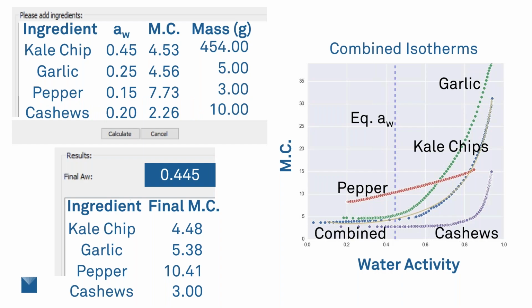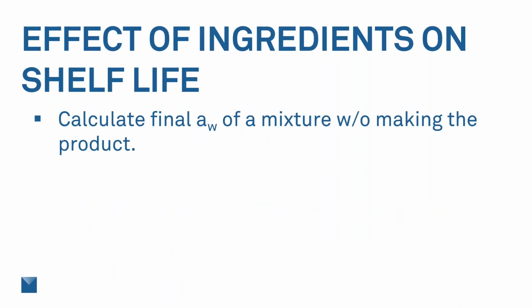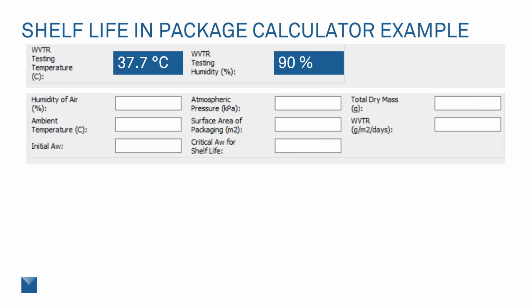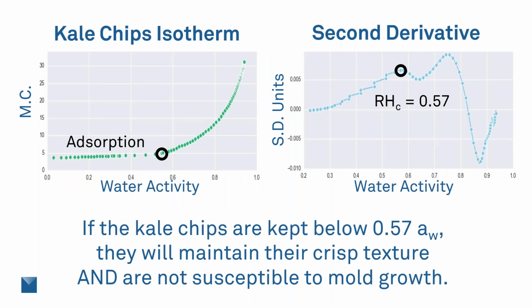Okay, we had another one come in asking about the second derivative that you were taking. I want to find that exact slide so that we can address this. The question concerns the changes here, because we see on the right graph that following that 0.57 point, we have a lot of movement up and down that seems much more drastic than what is going on at that first 0.57 point. So the question is, shouldn't we be more concerned about the other stuff, as opposed to just that first change that we're seeing there?